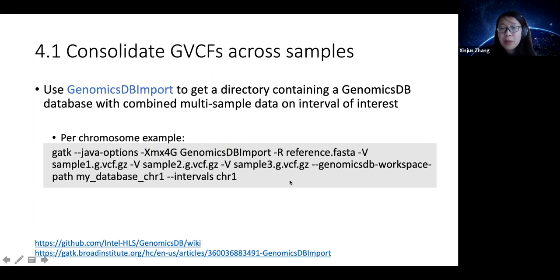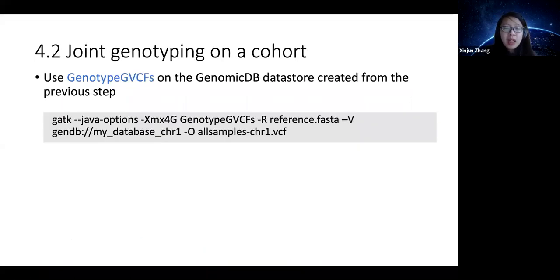Depending on how big your file is and how many samples you have, it may take anything between a couple of hours to quite a few hours. So after all that, when that's finished running, you're ready for this part. If you're doing chromosome by chromosome, this step doesn't take that long to run. You can watch that happen.